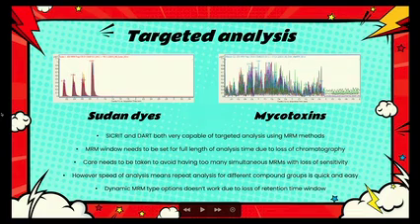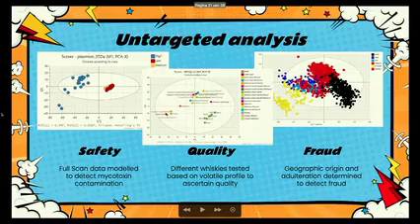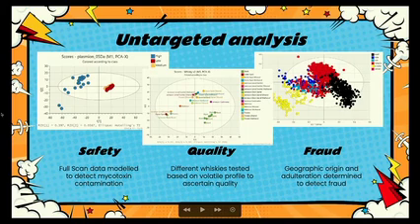So you can go targeted and you can look for specific compounds. Obviously, you can do untargeted analysis and then start building chemometric models and just process the data. So you can do full scan stuff, and you can do all of your conventional DIA stuff, you can do anything that you can do with a LCMS, as long as you're not reliant on time sectoring. You can do it with an ambient ionization source, and you can also do it with direct injection.